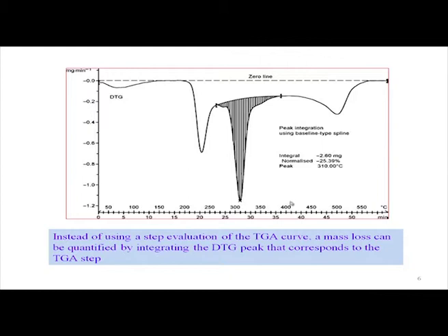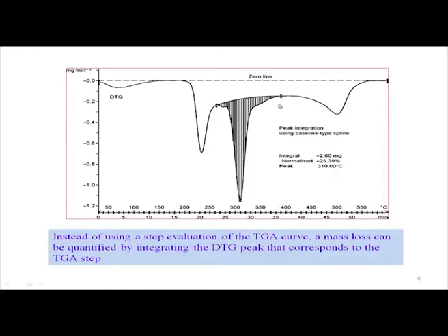So, you have the data in your hand, and you can also quantify it in terms of area determination. This derivative plot will give us some information in this regard, that is how you get this derivative plot and how we can correlate it with your thermogravimetric plot.